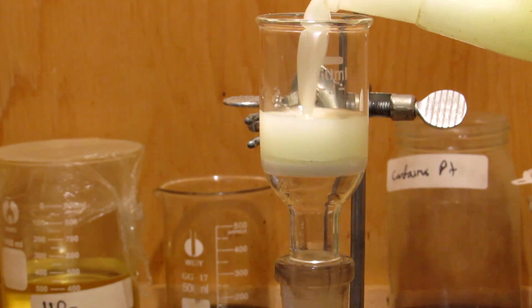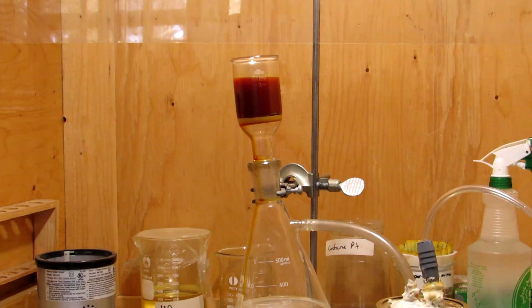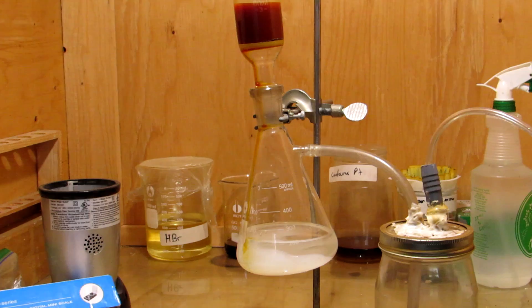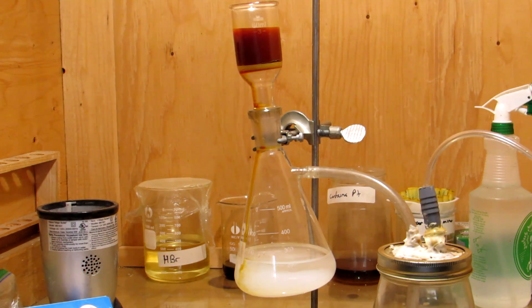Once the apparatus was disassembled, the sulfur suspension was vacuum filtered. During the filtration, some of the iodine hadn't reacted and was stuck to the stir bar with some sulfur, protecting it from the solution. After scraping it off into the filter, the color disappeared as dissolved hydrogen sulfide gas in the solution reacted with the iodine to form more elemental sulfur. The solution was filtered a second time to recover this newly produced sulfur as well.